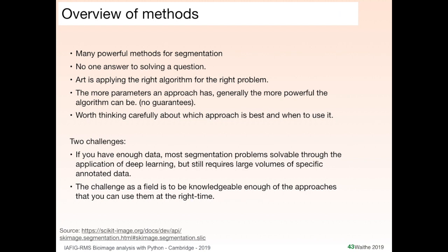So you notice when Stephen was talking about his segmentation, he used ISO data, was it? Which is a very standard histogram interrogation, but it worked very well for what he did. So he used it because it's almost instantaneous processing, and it was completely sufficient. The worst thing you can do is throw the most advanced technique at a problem that doesn't need it.